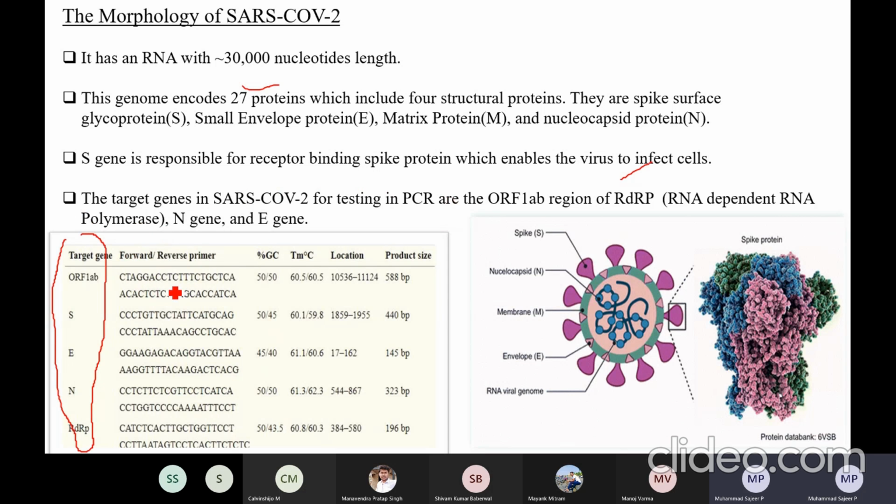So what we actually do is, if I want to do PCR, I will find a specific target gene in that virus or bacteria, whatever I want to detect, and I will use a tool. For example, you have Primer3 software tools where you can design the primers. We can design the primer sequence based on the target gene. If you give the target gene, you can make it.